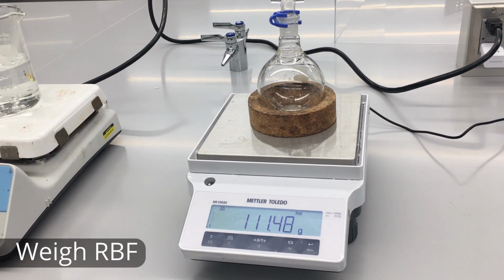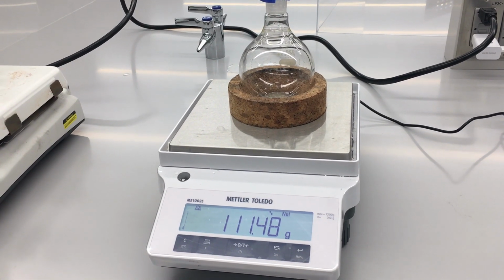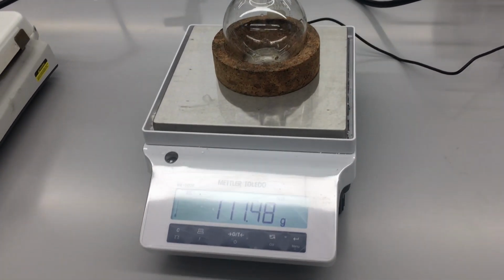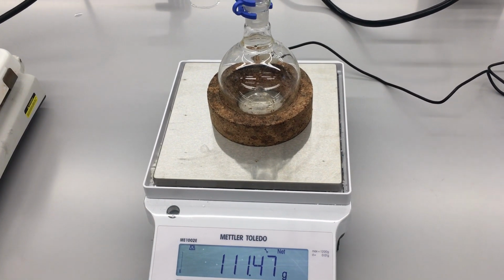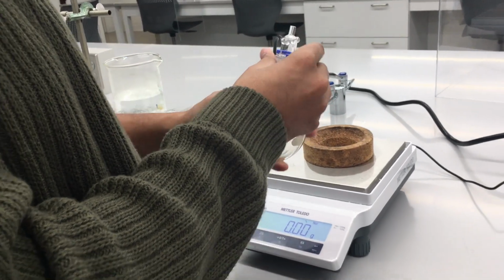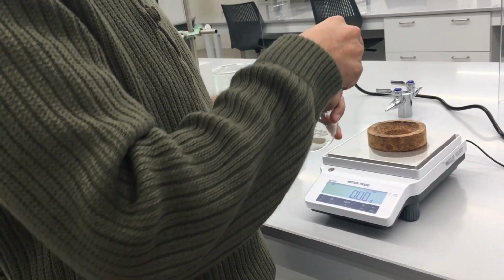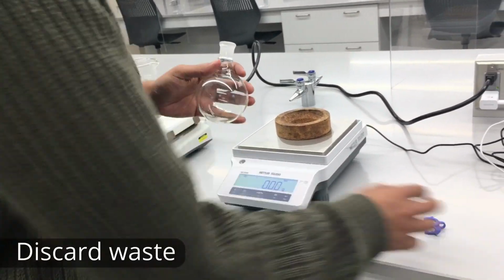All right, we can see that little pool of liquid in there, which means we've now condensed all of that gas down. And now we need to figure out what the mass is of that liquid inside, because that'll be the mass of our volatile compound. So we'll move over here and take the mass of our entire vent assembly and round bottom flask plus the liquid. So you can go ahead and record that. So 111.48 grams. Now, if we subtract that from our previous mass, which was just of the round bottom flask, that will give us the total mass of the liquid or the volatile compound on its own.